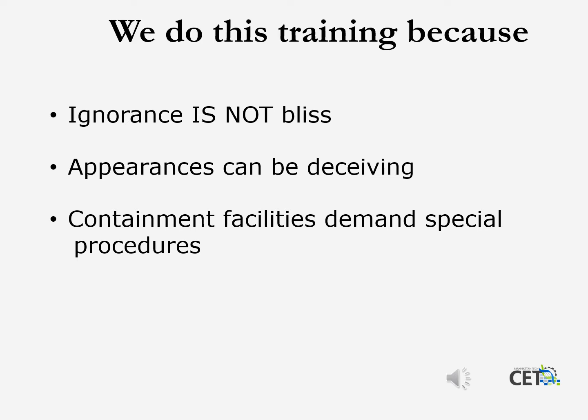Of course, you've worked and you understand your job, and you understand the systems and the features of the facilities that you'll be working with. This training is not intended to teach you that. It's intended to teach you how to use those systems and those mechanical features in high containment, or a synonym for that is critical environment, to keep yourself safe, to keep the facility safe, and to keep the public safe.